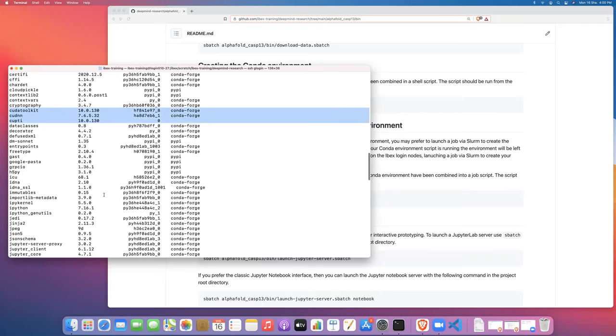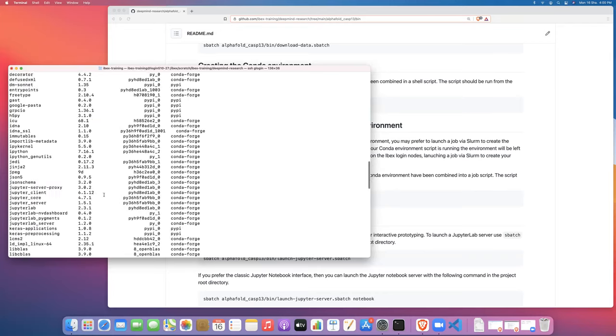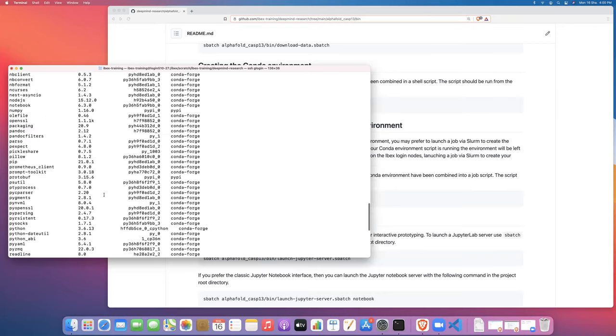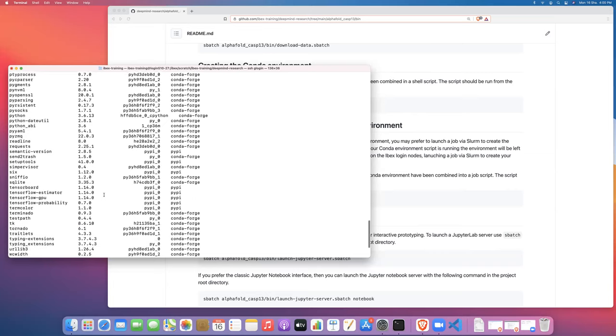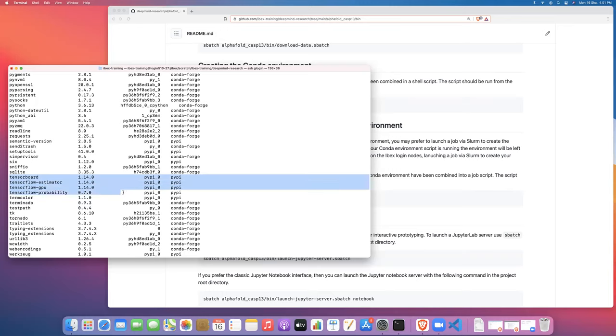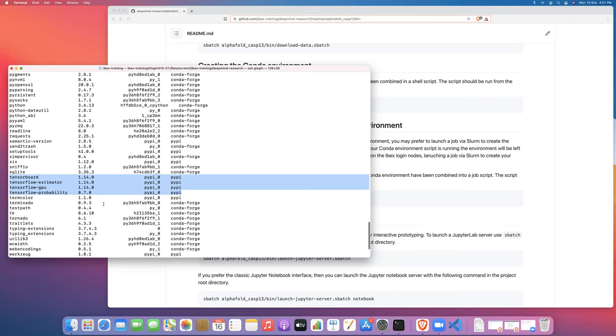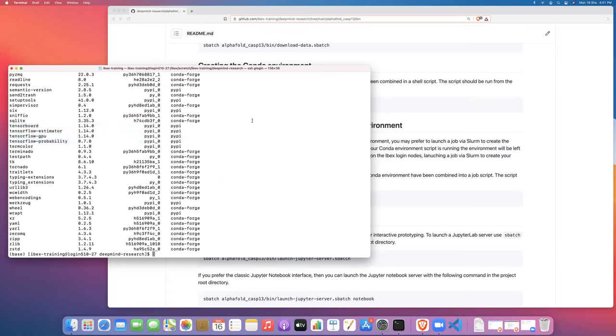And if we scroll down, we can find our TensorFlow dependencies. So here's TensorBoard, tensorflow-estimator, tensorflow-gpu, and tensorflow-probability. So those are all installed, as well as all of the dependencies that those will need. That's what you should see once the conda environment creation step has finished. And then we'll be good to go.